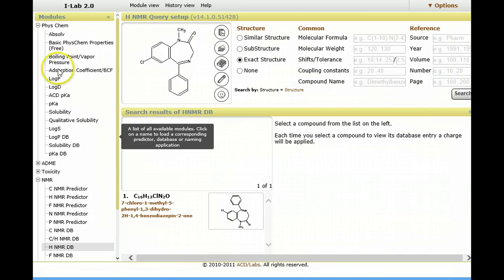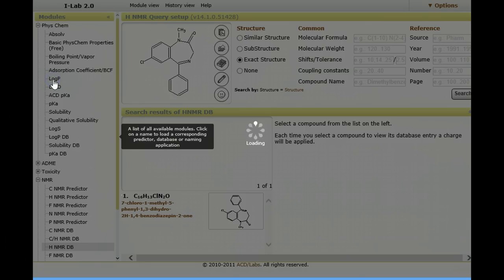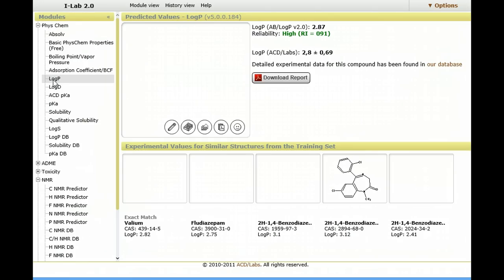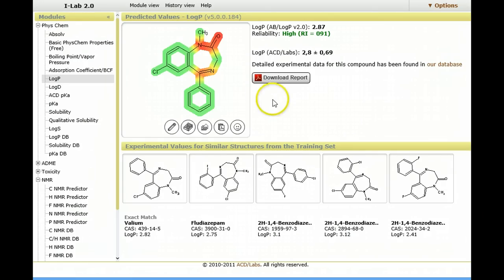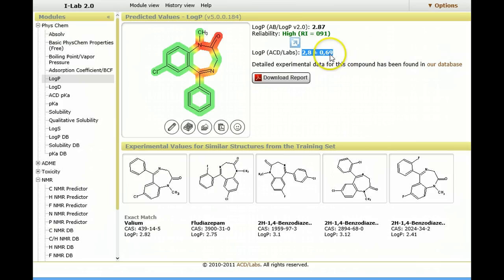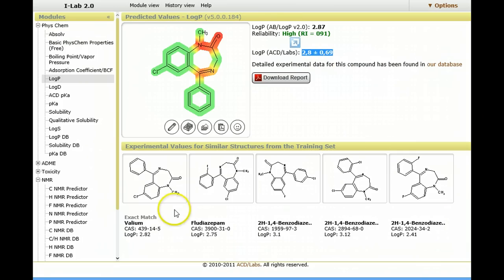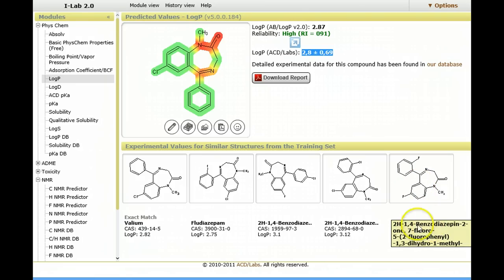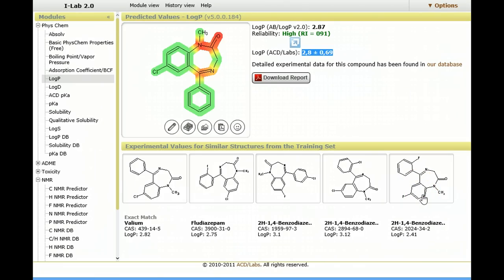Let's assume that we'd like to calculate a log p-value. We simply open the PhysCam properties, and here we see the log p-value is calculated. There's a lot of hover boxes that give us information about what each of the values is. You can see here the experimental values for similar structures from the training set that has been used to deliver the log p prediction algorithm.